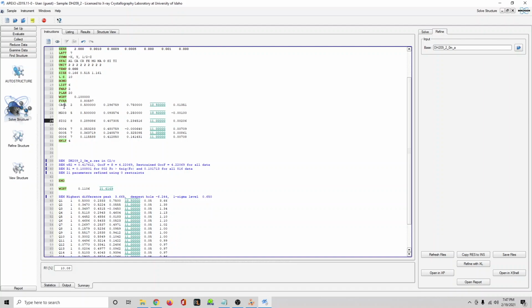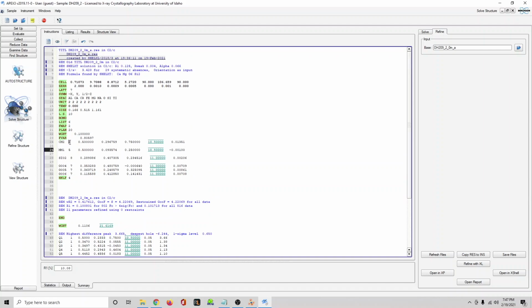So this is calcium in the M2 site. So I'm going to label it CM2, which is probably a better way of doing it, just to copy my colleagues' way of doing it. Magnesium in M1, so MM1 is a fair way of saying that. And of course this number here just corresponds to the number listed on the scattering factor, not structure factor. So AL would be 1, CA is 2, MG is 5, and that's how that all works. And there's only one tetrahedral site, so I'll just erase that and just say 1.